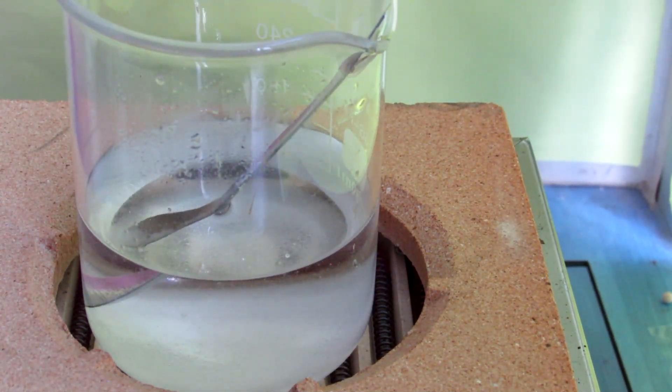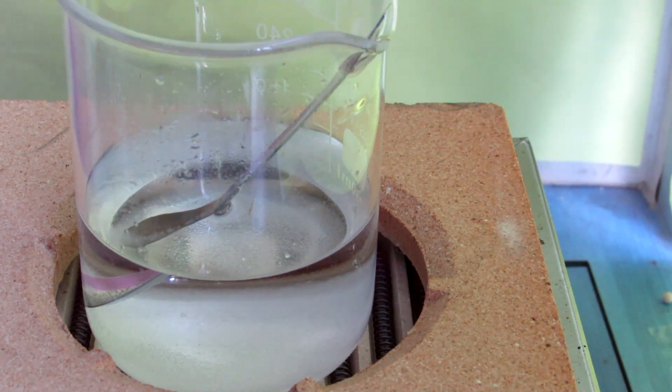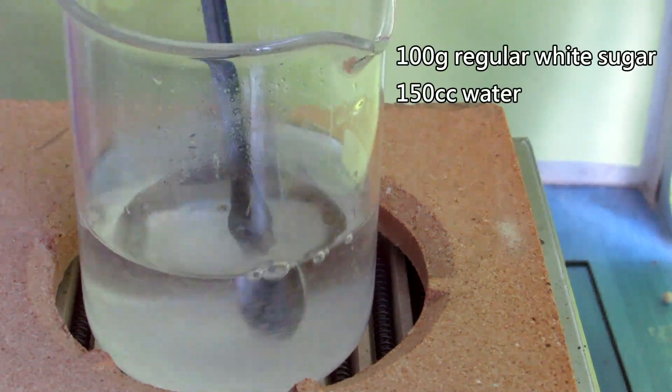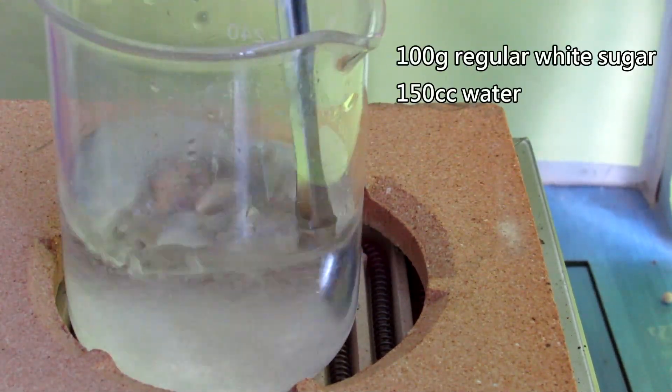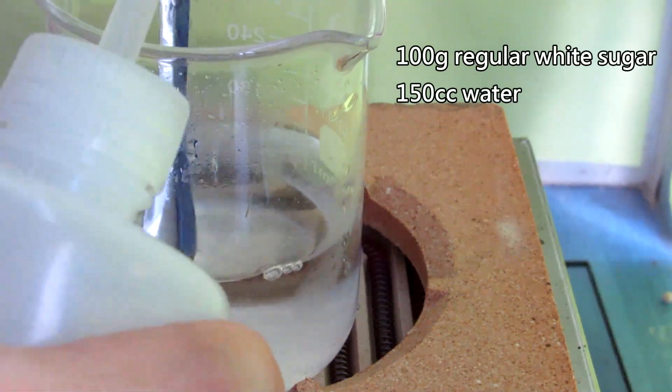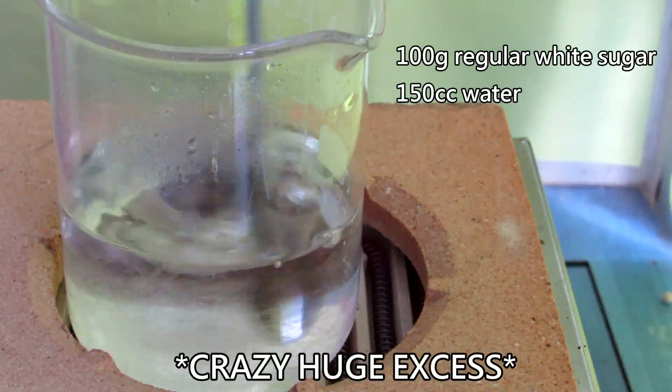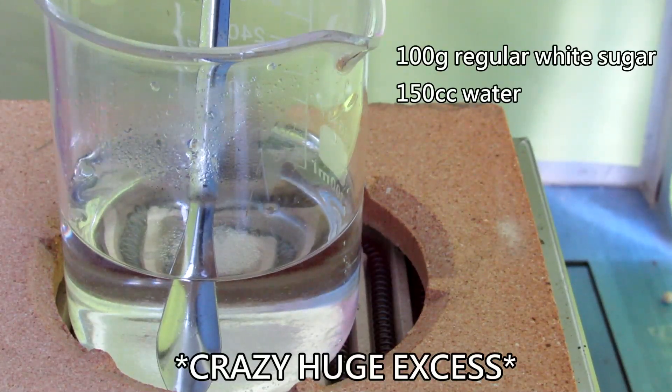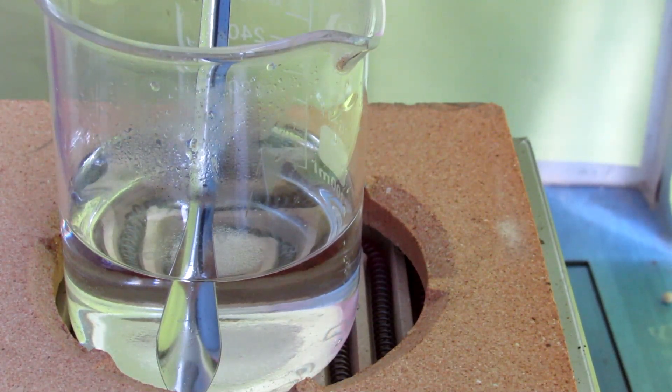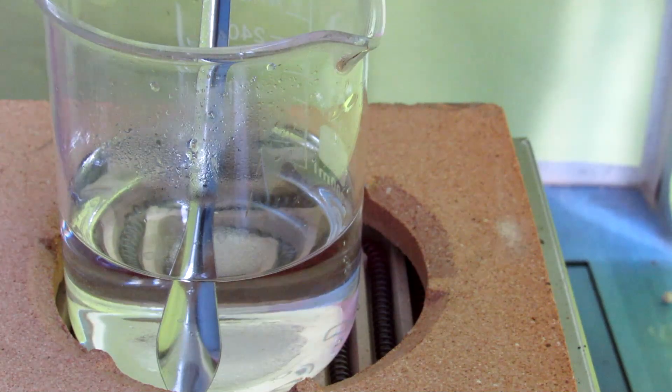Then, prepare some reducing sugar solution. In this case, I dissolved about 100 grams of sugar in 150 cc of water. This is actually a huge excess, but sugar is very cheap, and extra sugar won't hurt the reaction at all.